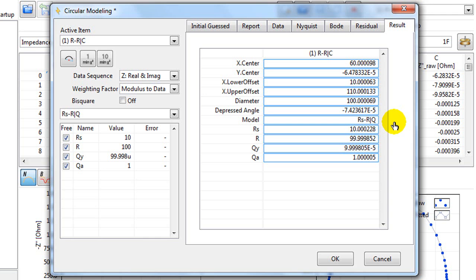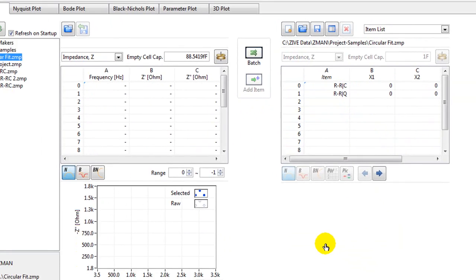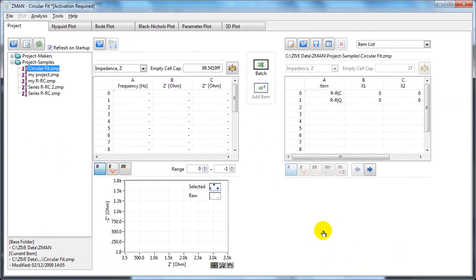You should then click OK to accept these parameters. And the values are transferred to the model parameters for the modelling.